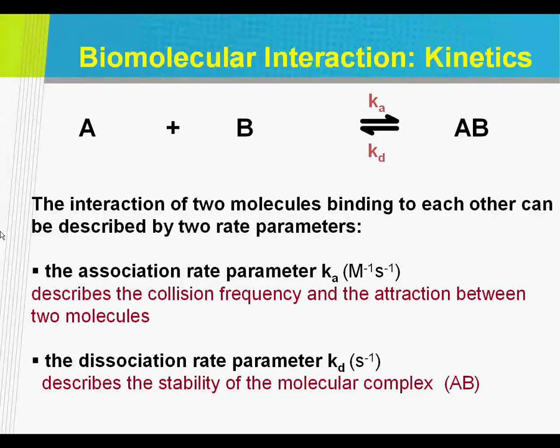So you can then go ahead and look into this a little bit more and try to analyze what happens, and this becomes quite a mathematical approach. But at the end of the day, if you buy instruments like ProteOn or Biacore or anything like that, it comes with software that will look at your binding kinetics, or binding pairs that I'm pointing out here, and dissect it and assign a mathematical model, most of the time a one-to-one binding model, and derive these parameters for you.